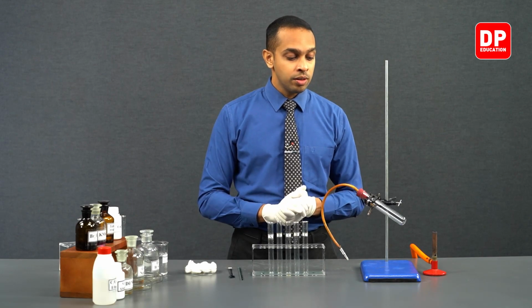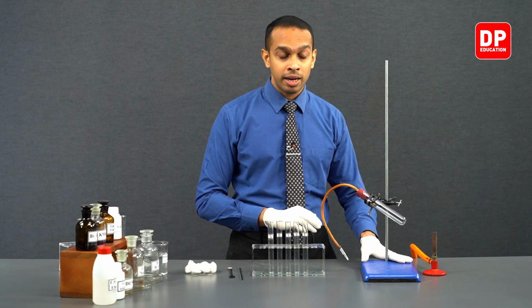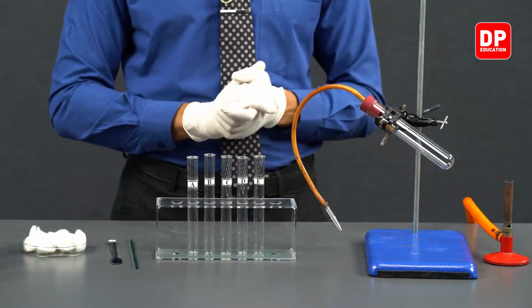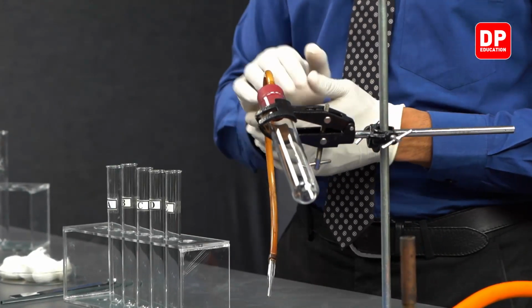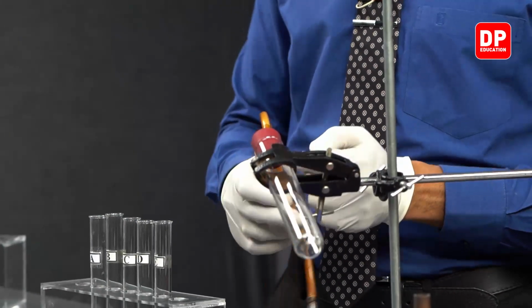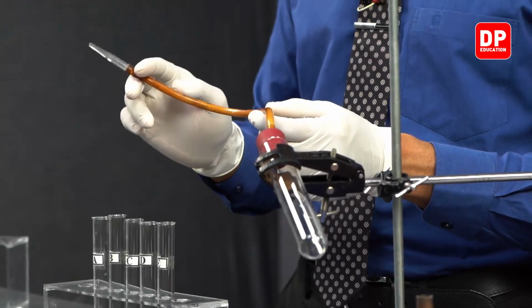Then we will be using this retort stand, and on this clamp you can see we have a boiling tube fixed, and on top of this boiling tube we have a rubber stopper attached to a delivery tube.